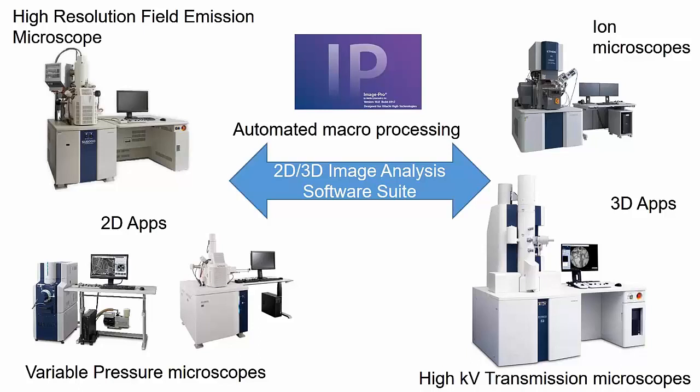The other thing, if you haven't picked up, is that we can process images, measure those images, and represent that data in a visual format, whether it's a bar chart or just outputting statistics. And it's all the same software, all the same interface.